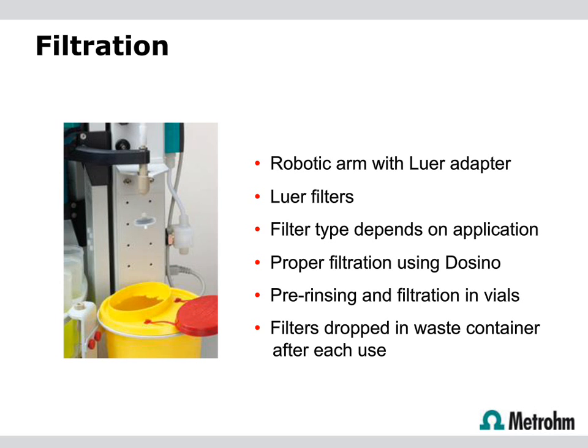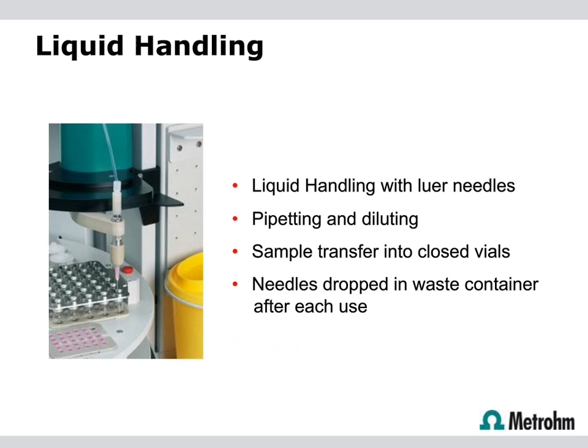You could then attach a filter to that lower fitting. And again, if you look to the left of that yellow bucket type thing at the bottom of the picture, there's actually a port there which you can use to transport sample directly through the filter and to an HPLC system or an IC system for analysis. If you wanted to not have the complete online solution, you could pick up a needle and deliver sample into an HPLC type vial.